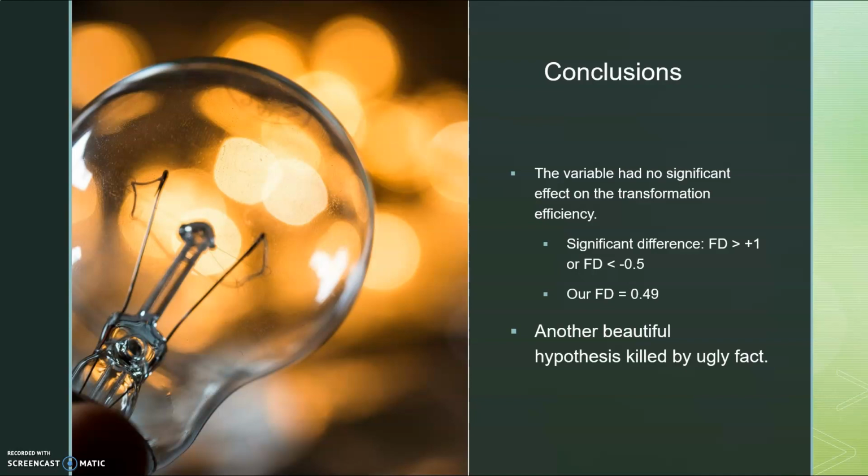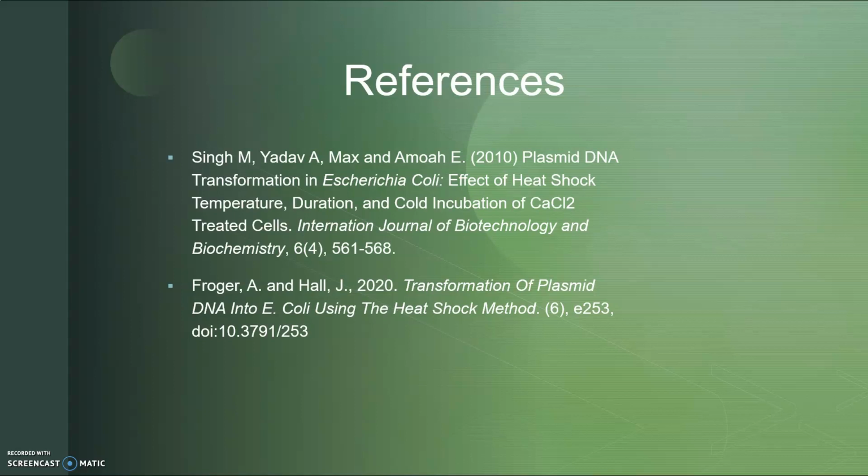This causes us to reject our hypothesis that if heat shock is reduced from 90 to 30 seconds, then the transformation efficiency will increase. And that's another beautiful hypothesis slain by an ugly fact. Here are our two references, which Caitlin and Avery referenced earlier in this video.